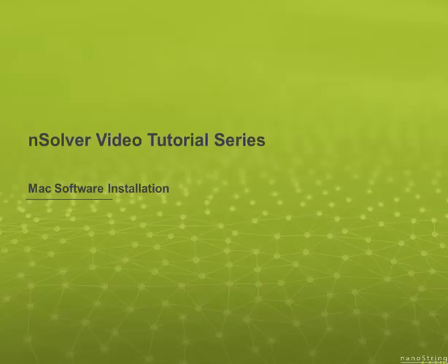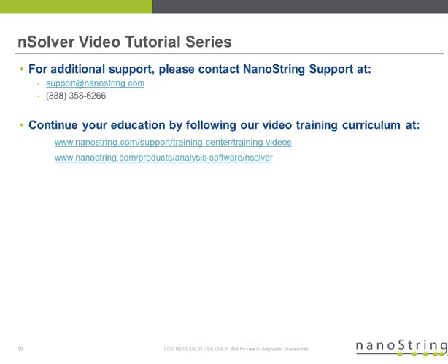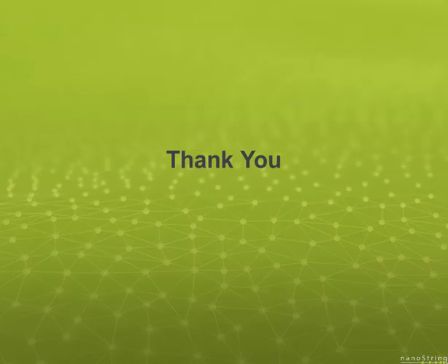This concludes the nSolver video tutorial software installation on a Mac computer. You can always contact NanoString support and check out our other video training curriculum online. Thank you.